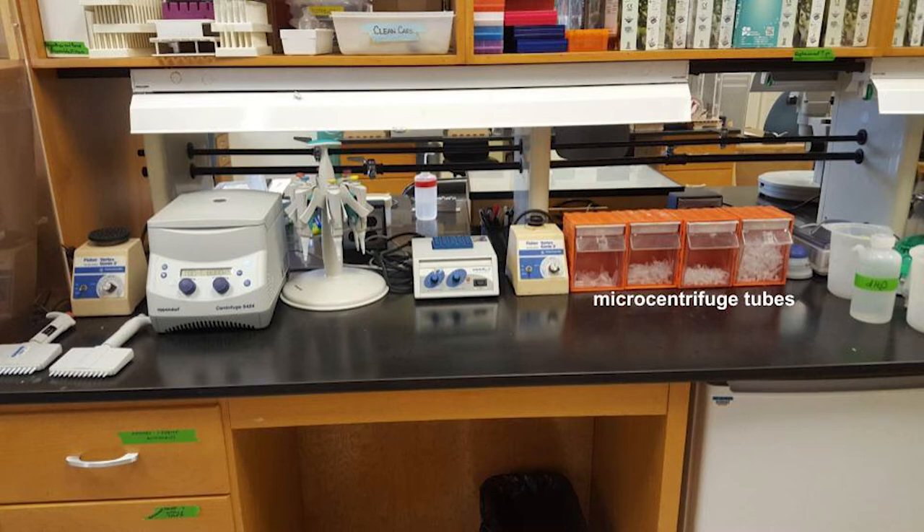Next to the tubes we have a machine called a vortex, which we use to mix samples. Then we have a heat block which heats our samples to a specific temperature. Next to the heat block we have a storage rack for all of our pipettes. We use pipettes to measure out a very small specific amount of liquid, and I'll demonstrate how we do that in just a second.